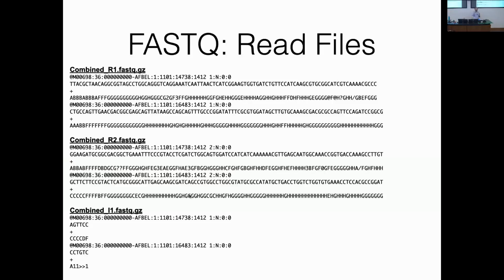It's actually etched on there, and there's a barcode on there that has a barcode version of the serial number, and if you look at the data that was generated by that flow cell, it's got that serial number right there. I think that's super cool. I cannot at all remember what that one is for.